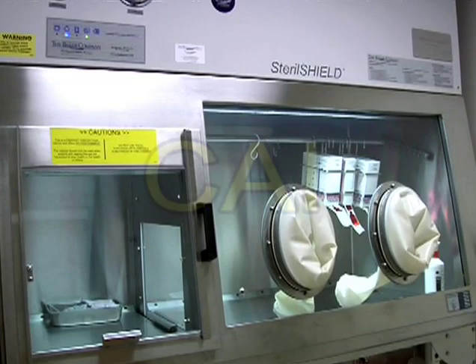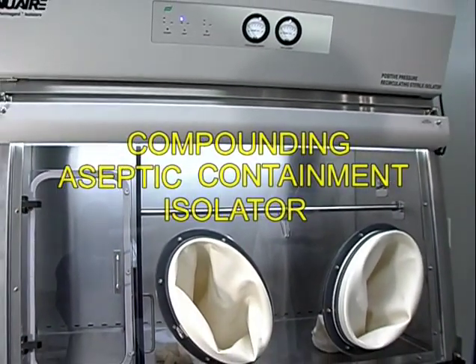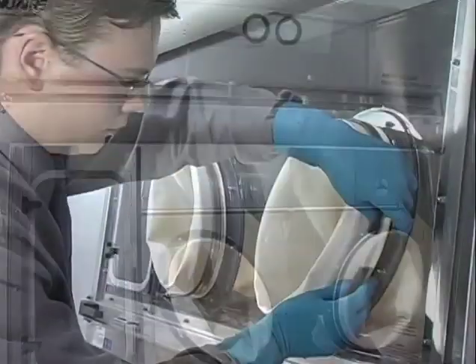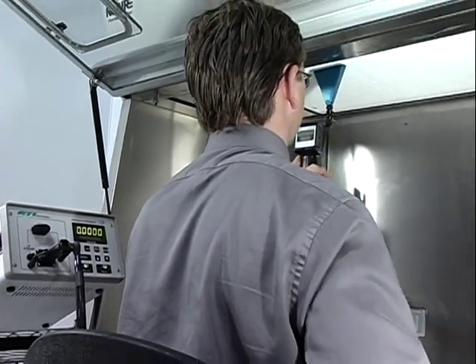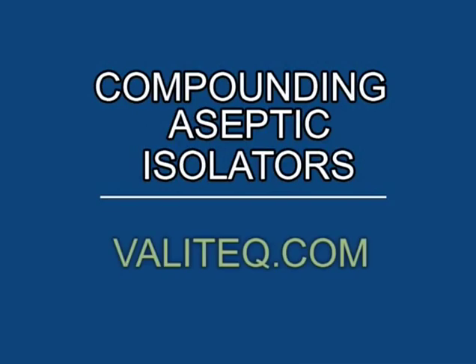A negative pressure version of the CAI is designed for use with hazardous drugs and is called a Compounding Aseptic Containment Isolator, or CACI. The selection, installation, certification, and operation of the new CAI concept are covered more fully in a separate lab safety DVD program, Compounding Aseptic Isolators, available directly from Valiteq.